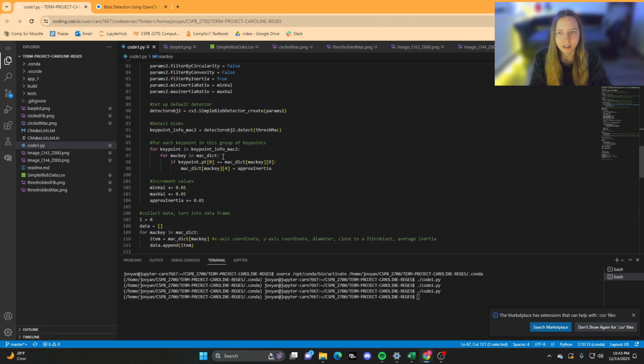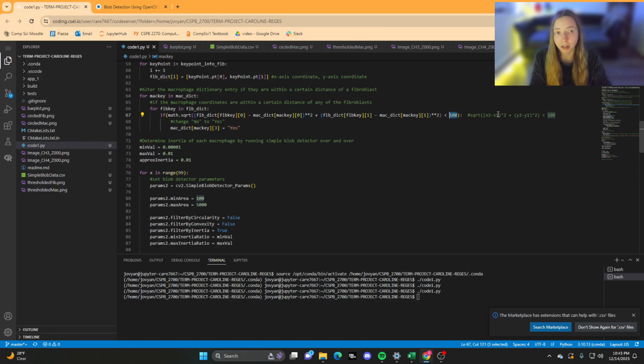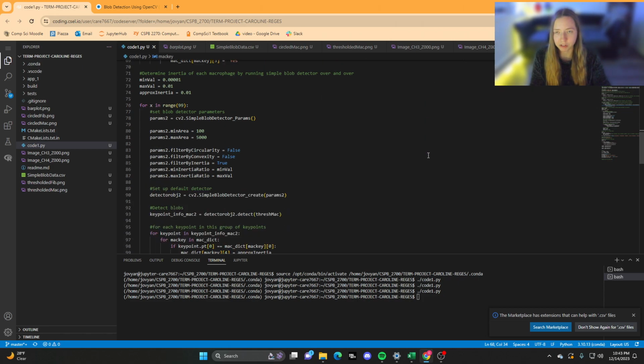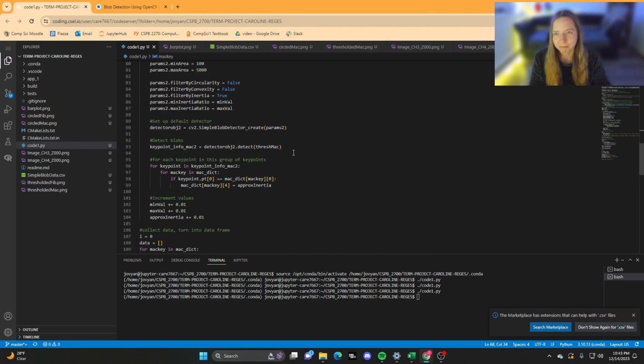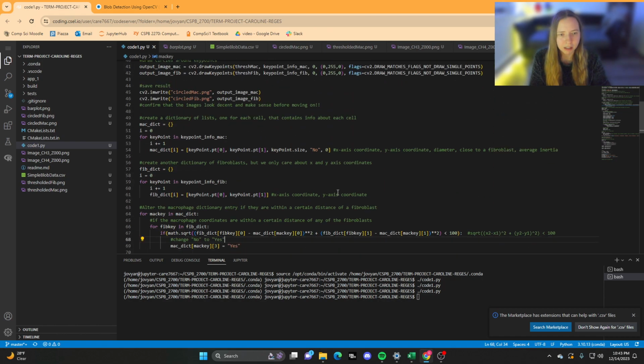Also, I don't actually have the size of that image. I don't know whether it was taken on 10x or 20x or what, because these are from a few years ago from someone who's not in the lab anymore, and that would really make a difference too. But anyways, I wanted to take this data and test how accurate this might be.